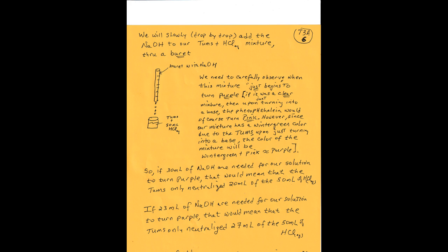We're going to slowly, drop by drop, add some sodium hydroxide. This is our titration procedure, to our Tums and HCl mixture, through a burette, right? There's the burette, and we're going to drip, drip, drip NaOH. This is the NaOH, sodium hydroxide. We're dripping it. It's a base.